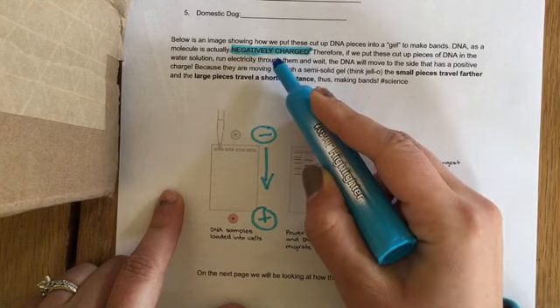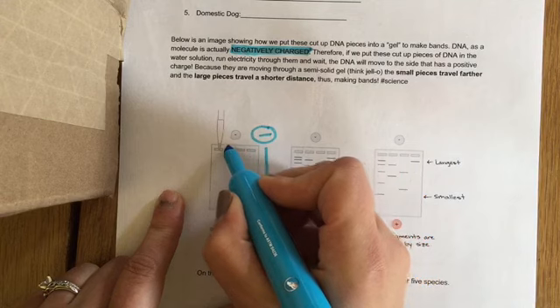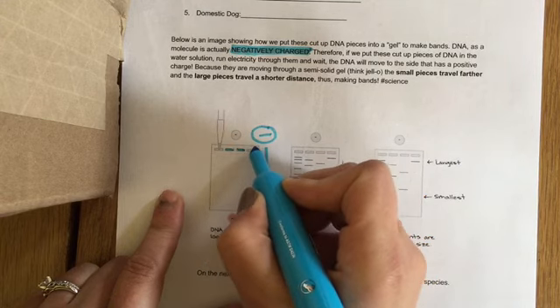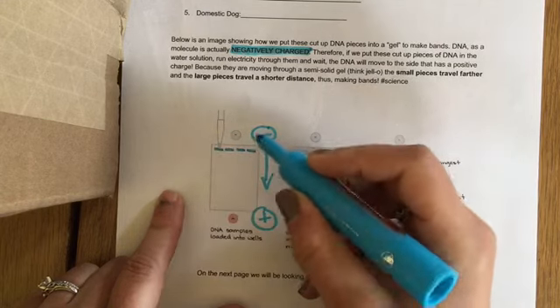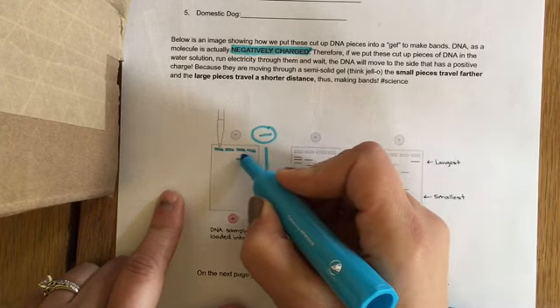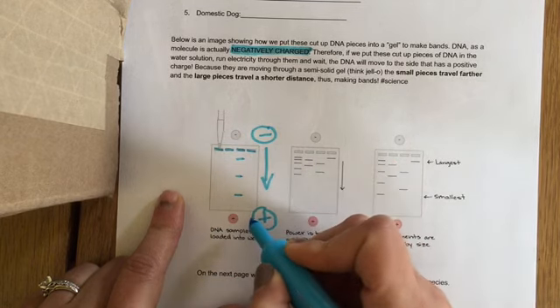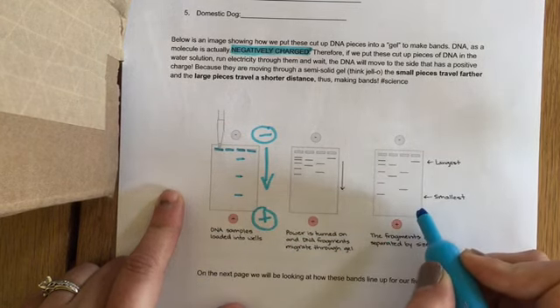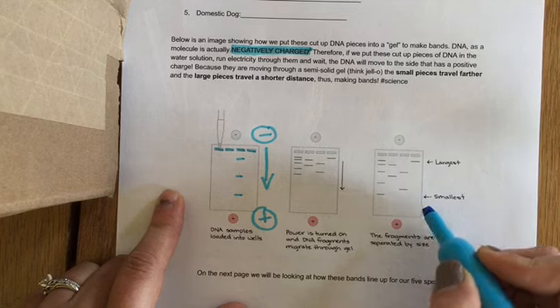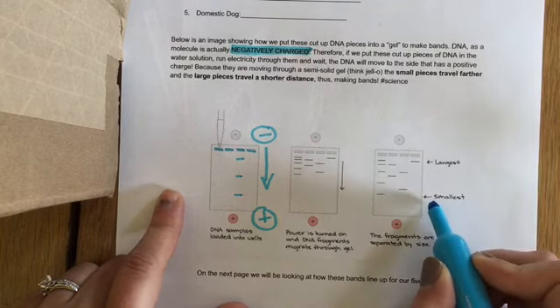Well, if DNA is negatively charged and we put it at the negative end, so if we fill these little wells with our negatively charged DNA and we run electricity through it, what happens is our DNA is going to start to migrate towards that positive end, and that's what actually creates those cool bands that we see. Little teeny tiny pieces of DNA are going to be able to travel the farthest.